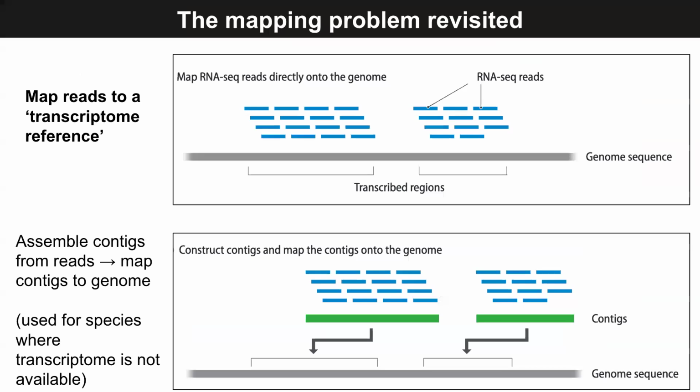Are we only sequencing one mRNA? No, you're sequencing the entire pool of mRNAs all at once. So you take that shearing thing, you shear it, you convert it to cDNA, throw this on a sequencer, and data comes out. That data is all the copies of 20,000 genes. So, okay, that's also a good question. And I think that's not there in the slide.